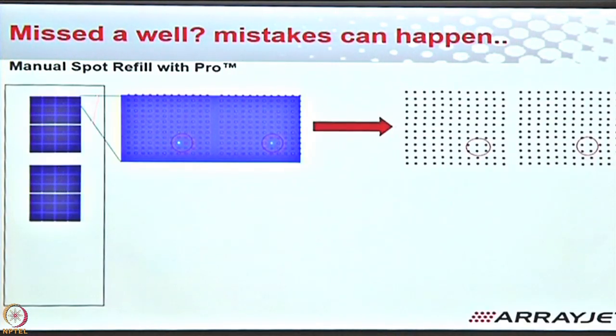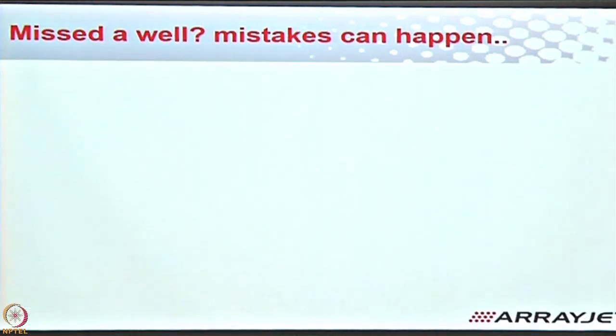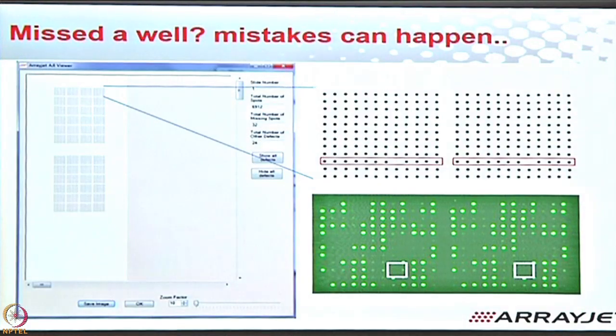And then when I start this overview run, the green area is where it will show me, to confirm and double check, that yes, my antibody that I just refilled is definitely going to get printed. It's not that I'm missing my entire experiment and the whole thing has gone to waste. It'll remember it and show you just to double check. Are you happy with this? Can I start? Can I press yes? You said yes. And then, ta-da, that's it.